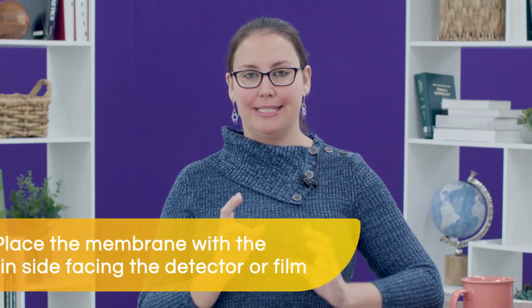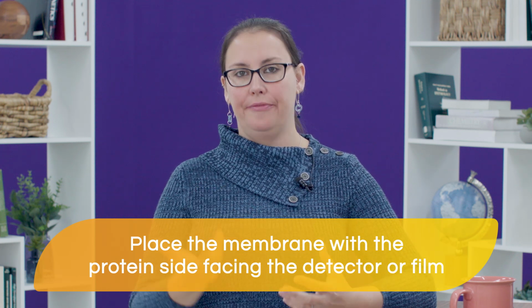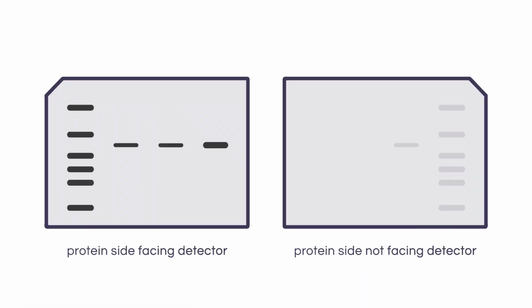It is also very important that you place the membrane in the correct orientation in your detection system, with the protein side facing the detector or the film. If you place the membrane incorrectly, the membrane itself is going to work as a barrier to the photons of light, really compromising the sensitivity of your assay. In this lesson, we have talked a lot about substrate best practices, and now on the next lesson, we're going to focus on the best practices on how to acquire your image.